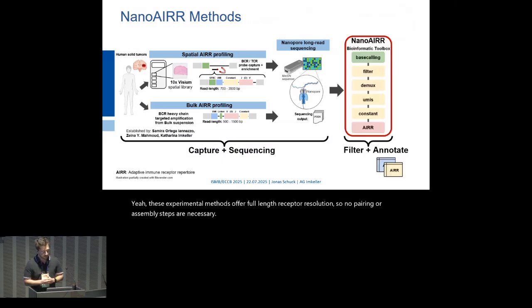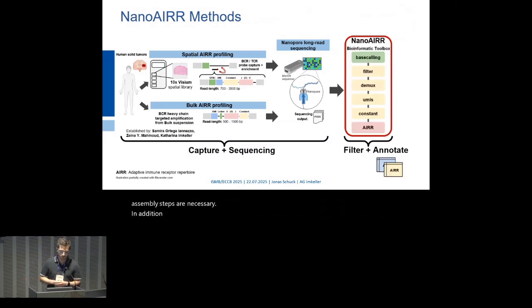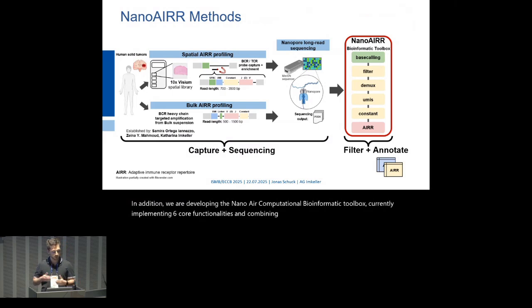In addition, we are developing the NanoAIRR computational bioinformatic toolbox, currently implementing 6 core functionalities and combining existing software, for example, from the Immcantation framework, with new functionalities to accurately process and annotate your receptor sequences that you generated with Nanopore sequencing.